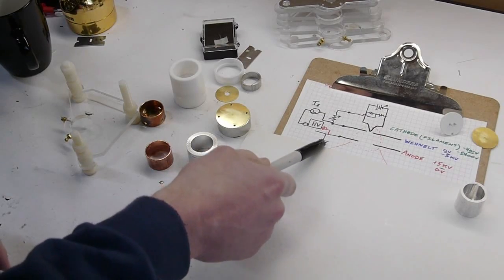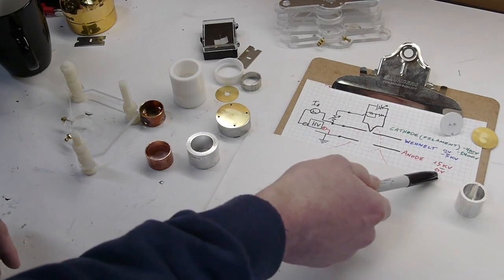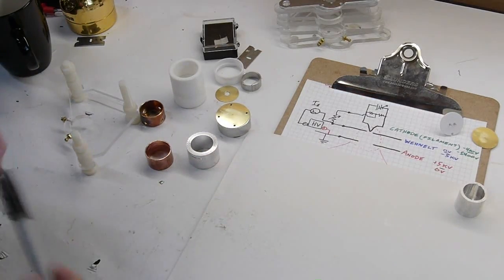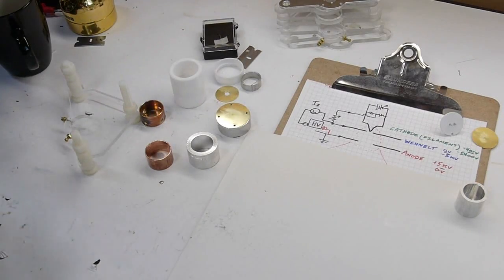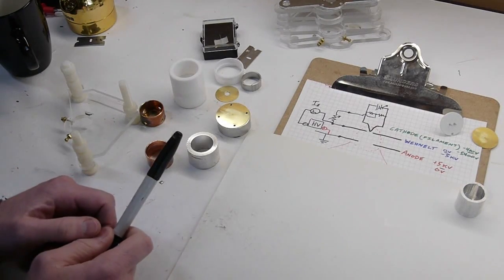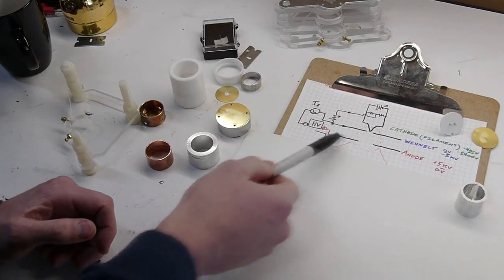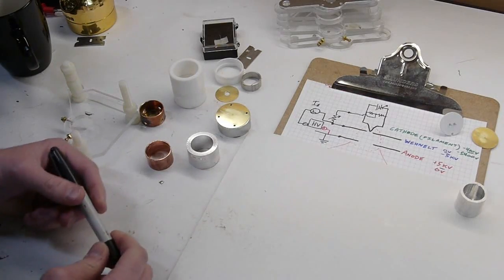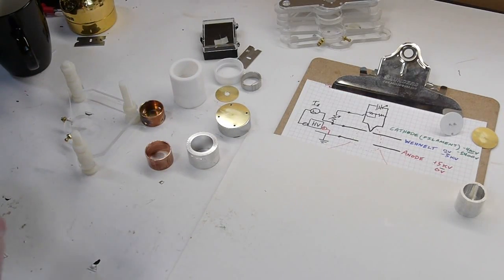So in this case we're going to call the anode ground zero and everything will be measured to that. So these are all just metal conductors. We're not going to talk about insulators yet or how this thing is built.